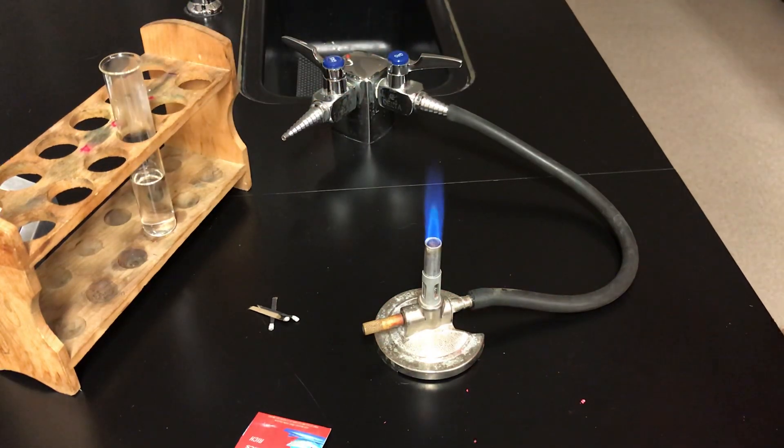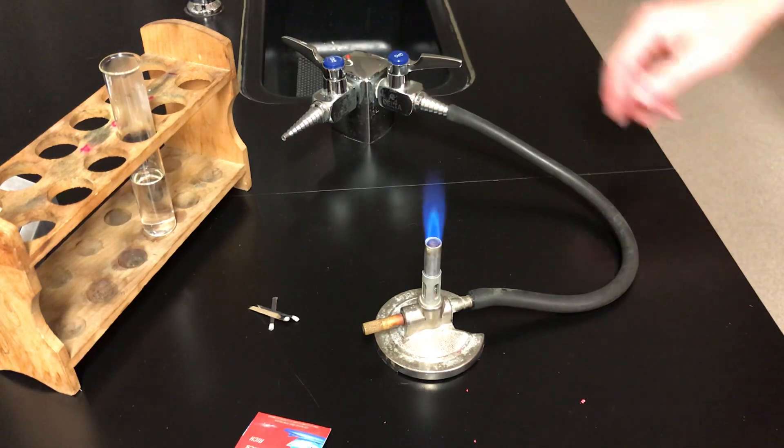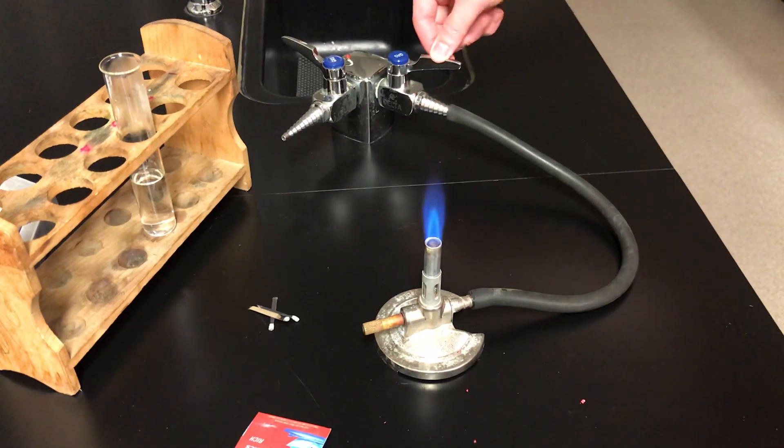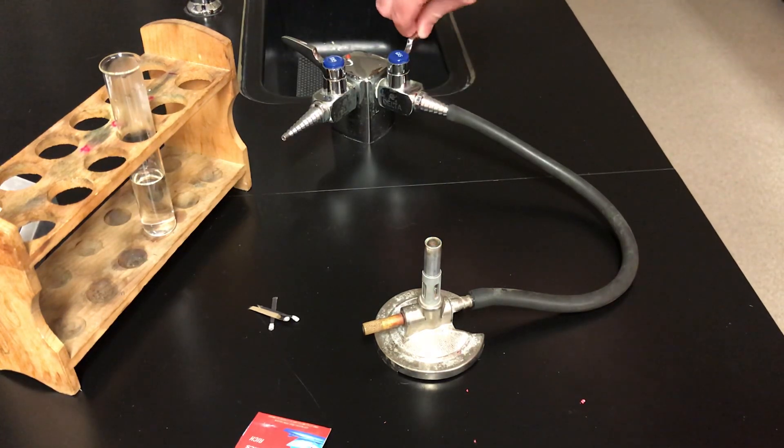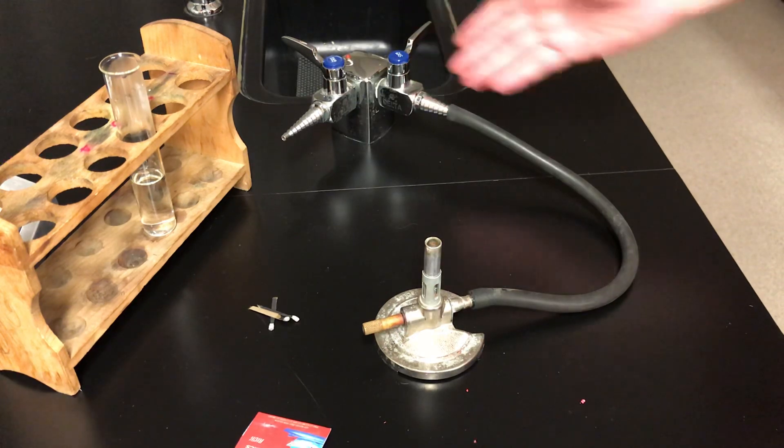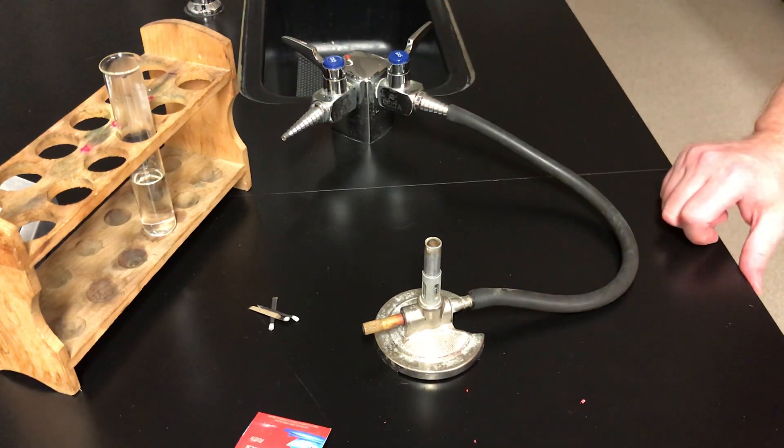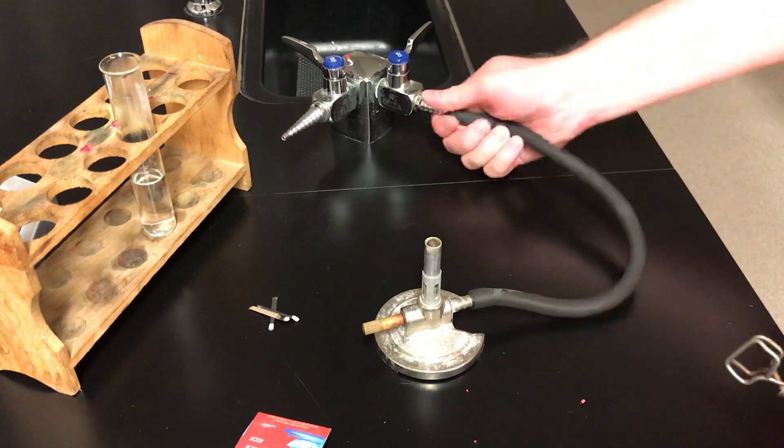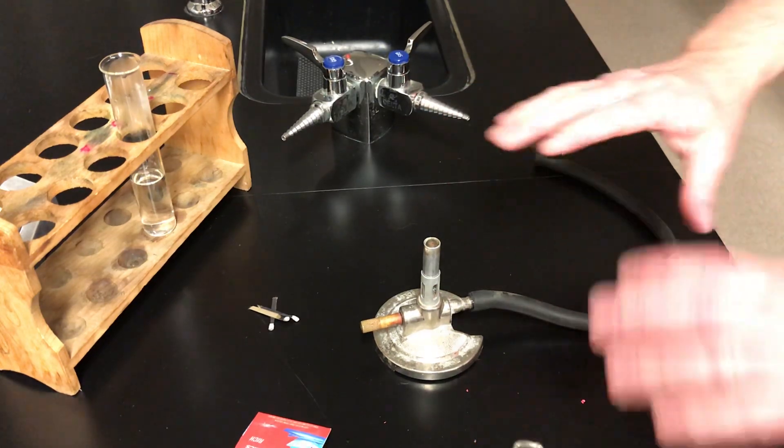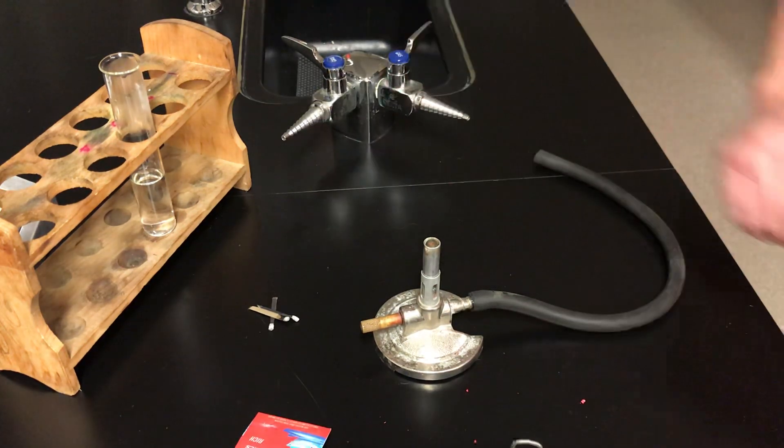Now when you're finished with the burner, don't just blow it out. When you're finished with the burner, use the nozzle like this. Turn the handle until it's perpendicular with the nozzle and the gas goes off. So there you have it. Lighting a burner, the parts of a burner, and using it to heat a test tube.